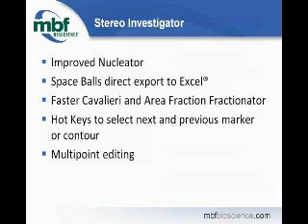So MBF Labs uses Stereo Investigator for our contract research that we do for academic researchers, pharmaceutical companies, private foundations. And because we use Stereo Investigator a lot, we run into situations where we'd love it to do just a little bit more or make it a little bit easier. And it's great having Paul and all the other software developers so accessible, because they've made some changes that have made performing stereology a lot less tedious.